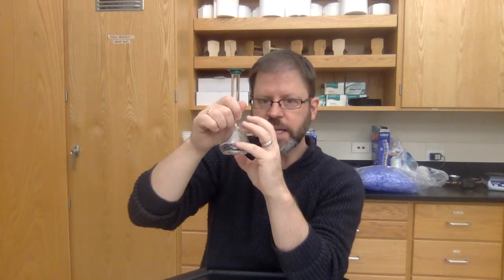Okay, so once you have this, it's very easy to work quantitatively and to know exactly how much solution. So at this point, you're doing the molarity calculation or grams per liter, whatever you want to do, but you're figuring out what concentration of vitamin C is in this.